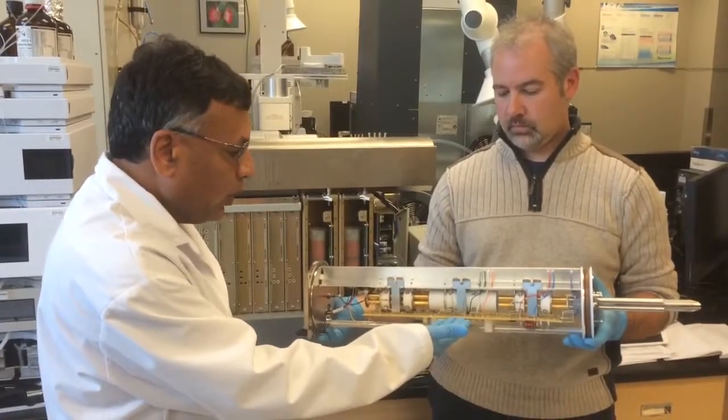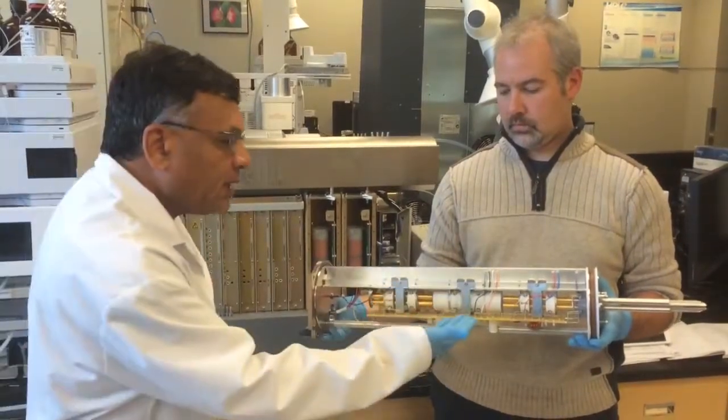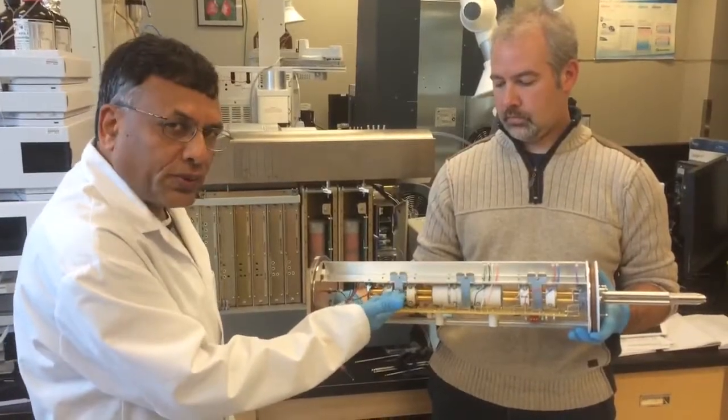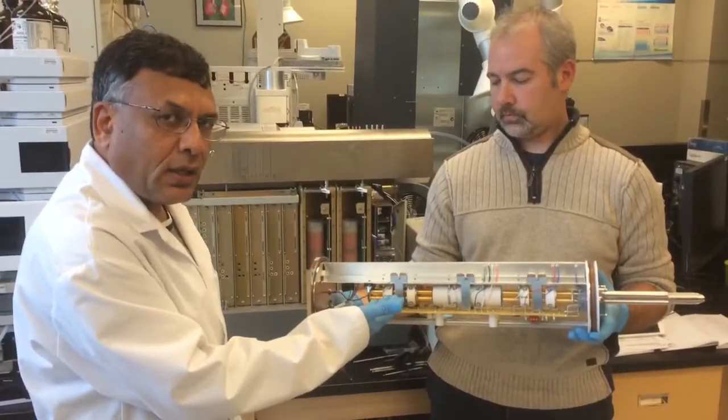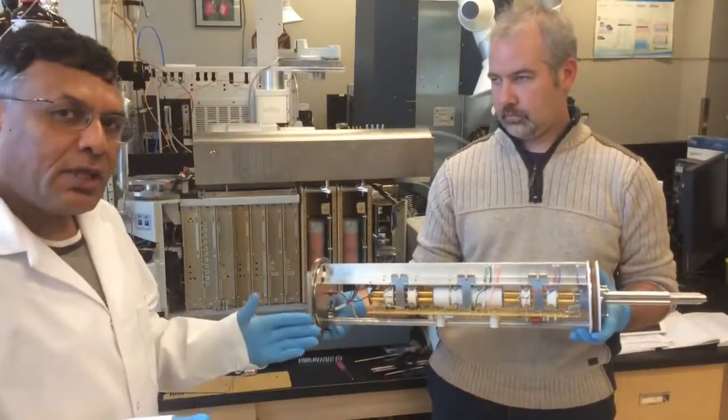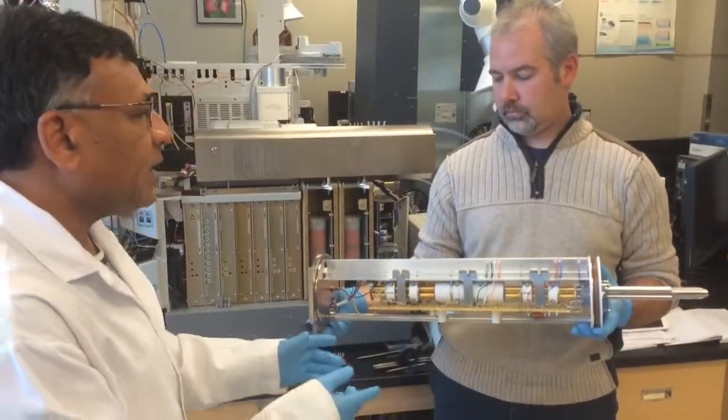Stage two is called quadrupole two. The fragments and their products go into quadrupole three, which is the third stage of the triple quadrupole mass spectrometer. In MS MS mode, all the ions from stage one get fragmented in stage two and are transmitted through stage three.